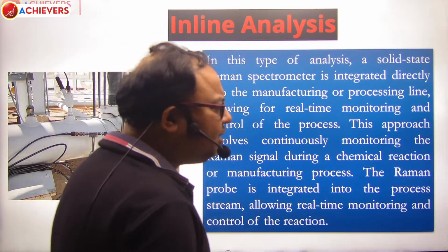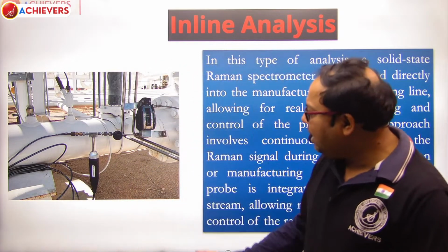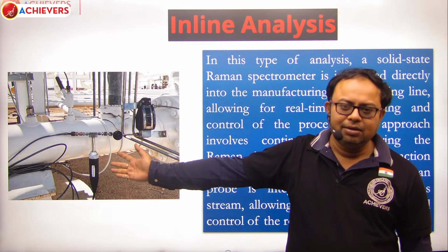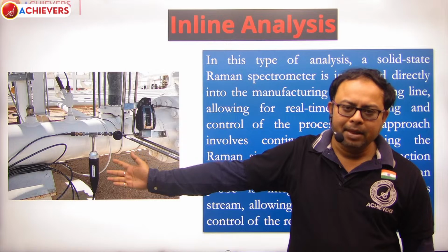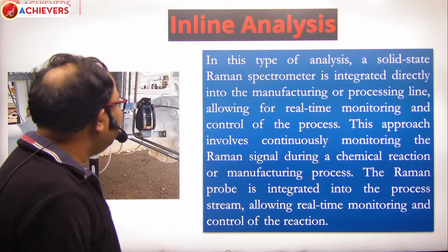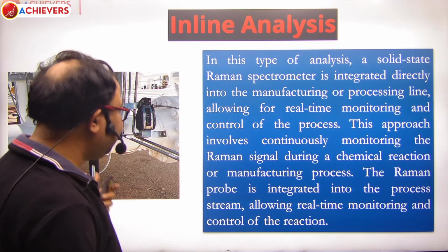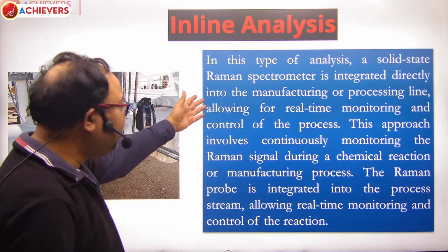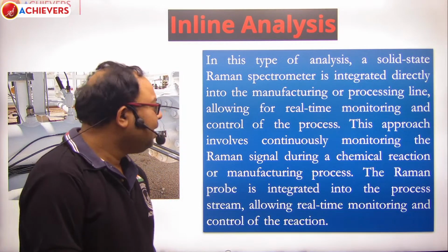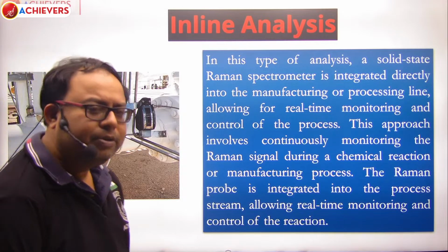At first, let us discuss the nuances of inline analysis. You can have a look into the instrumentation. Okay. Now, what is inline analysis all about? In this type of analysis, a solid state Raman spectrometer, this is a solid state Raman spectrometer, is integrated directly into the manufacturing or processing line. Okay. Allowing for real-time monitoring and control of the process.